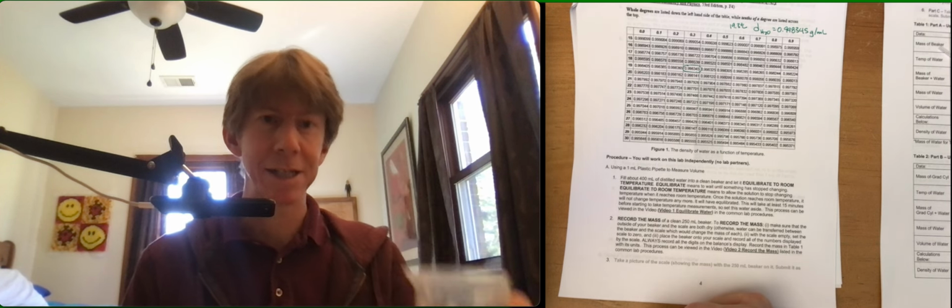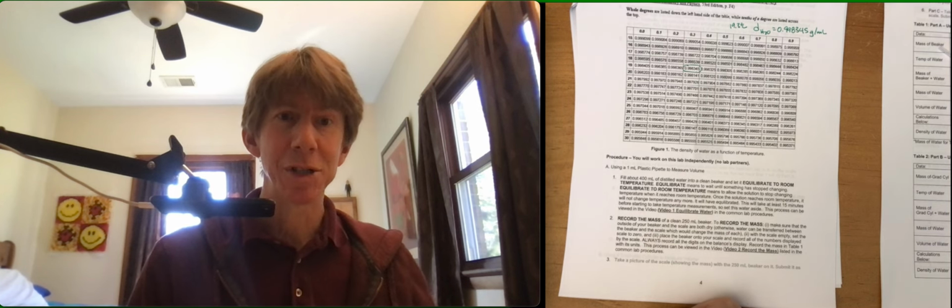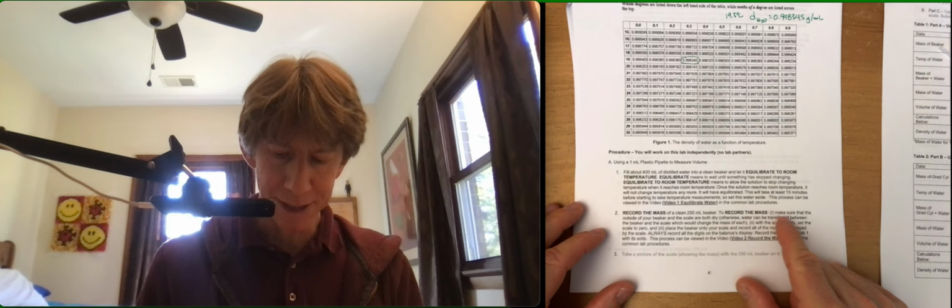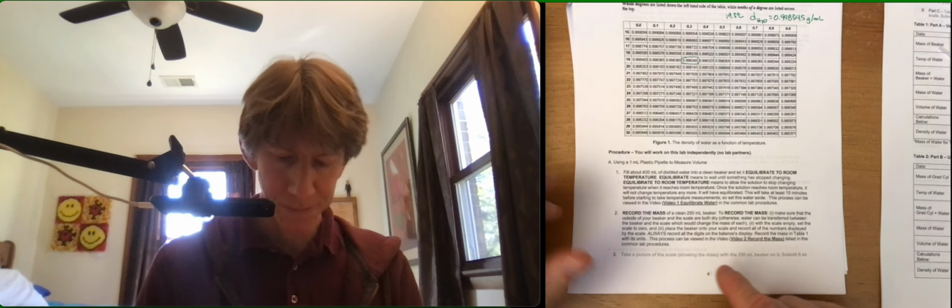My water, as I was getting set up to make this video, has been sitting there for at least 15 minutes. So I'm good to go in that regard. Next step, record the mass of a clean 250 milliliter beaker. To record the mass, make sure that the outside of the beaker and the scale are both dry, very important.